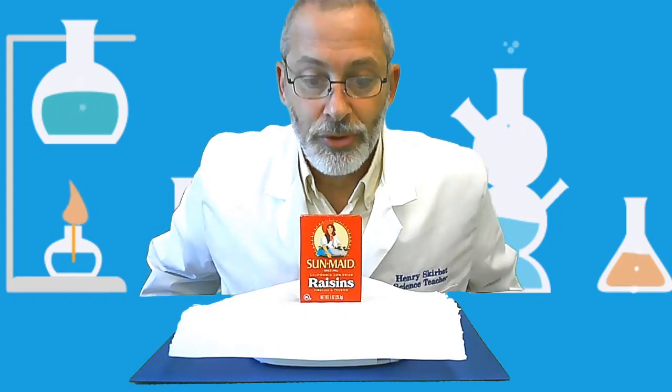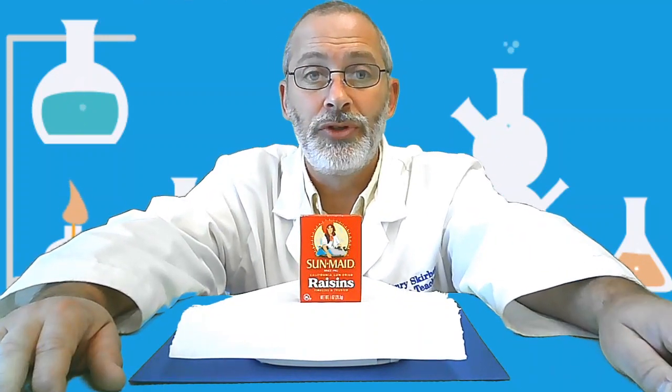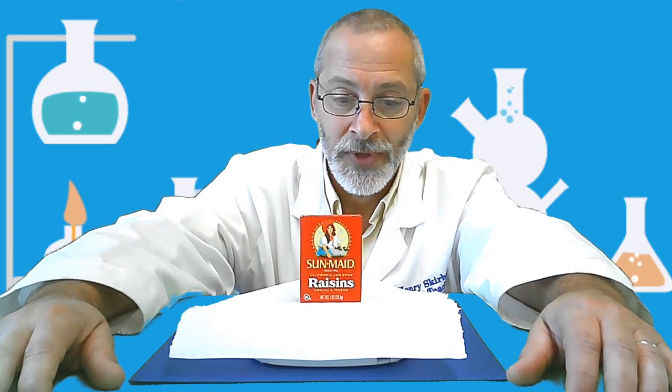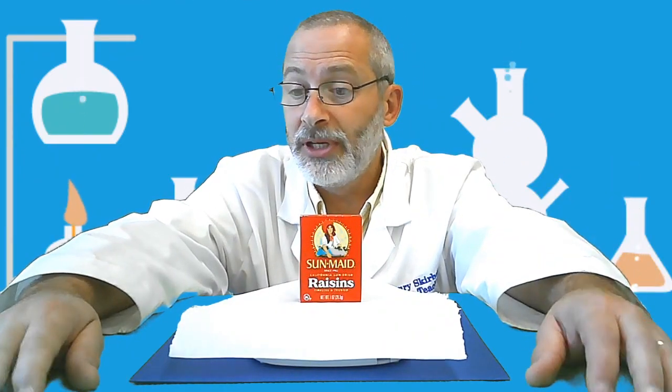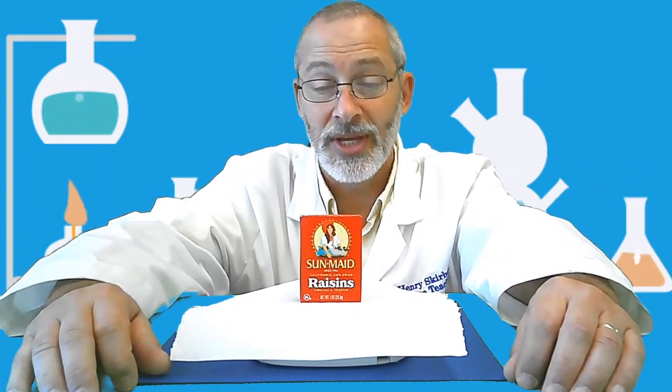All right, so you've written your hypothesis regarding this little classroom activity, our first of 2 experiments today. And take a moment to share your hypotheses with one another. All right, you've got some pretty interesting hypotheses. So today, let me demonstrate this activity myself, and let's see how it relates to your hypothesis, and we'll make some observations together.